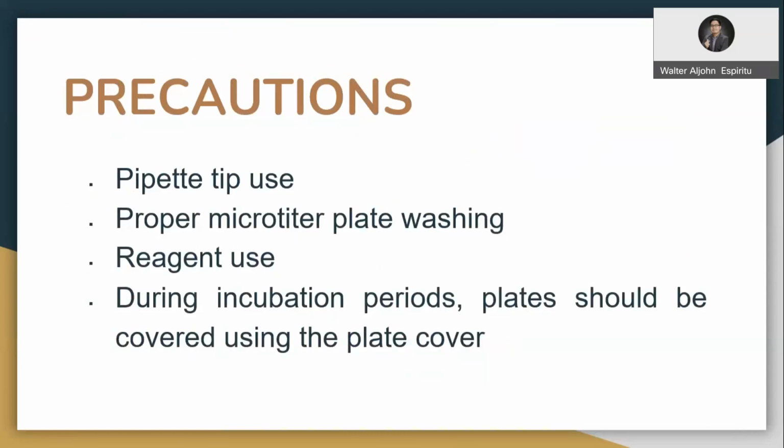Then proper microtiter plate washing, of course: addition of the buffer and then removing it. Make sure you have done that. Use the proper reagents from each specific colored tube only. And of course, observe the incubation periods correctly.